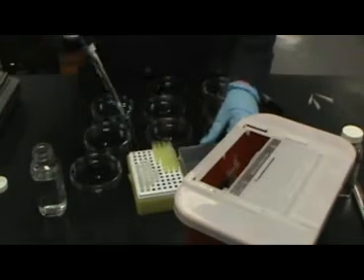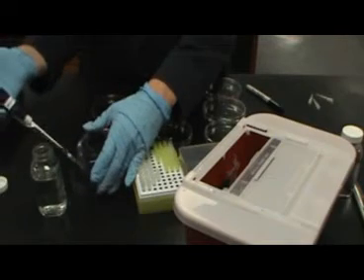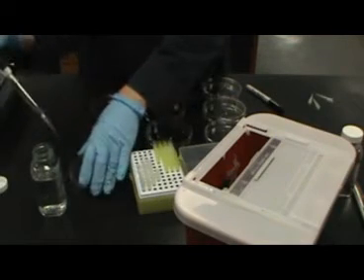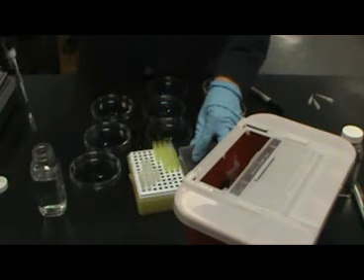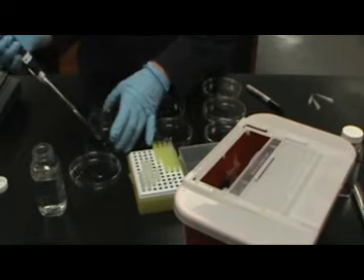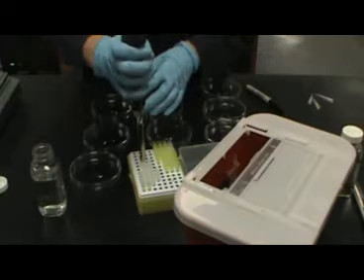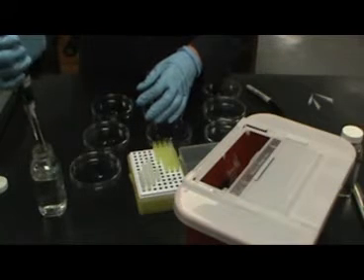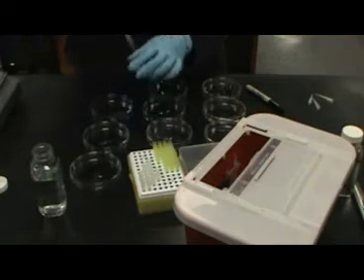The third set of plates will require the use of a micropipette. For this set of plates, which is your 10 to the negative 5 dilution, you will be adding 100 microliters of sample to each plate. This set of samples is 1/10 the amount of solution as was placed in the others. Therefore, the dilution factor will be 1/10 less.